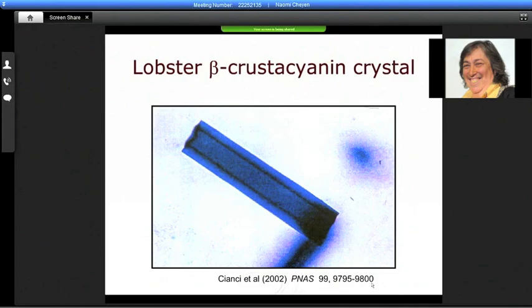And this could only be done using microbatch, because the paraffin oil doesn't allow any evaporation through it. But of course, there's no such thing as zero evaporation. And even 14 parts per million over enough time will give you something.